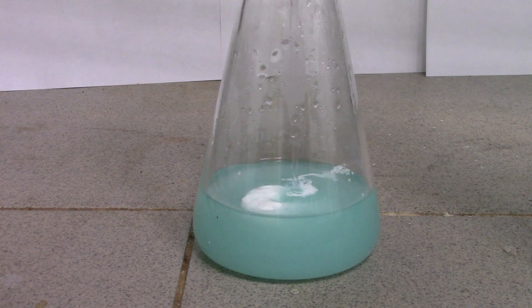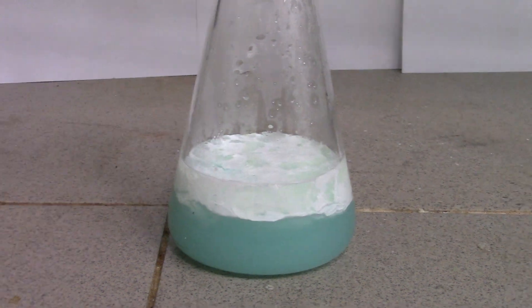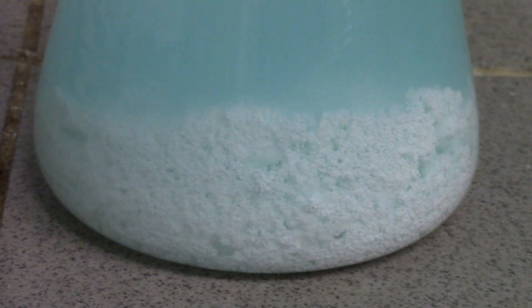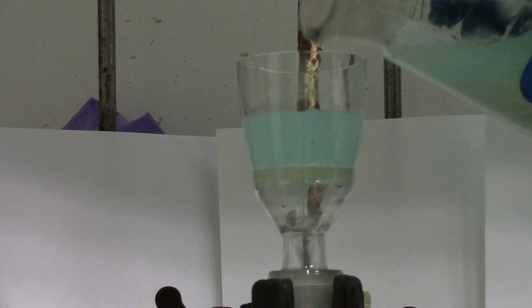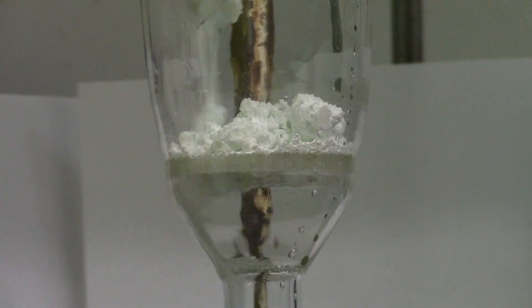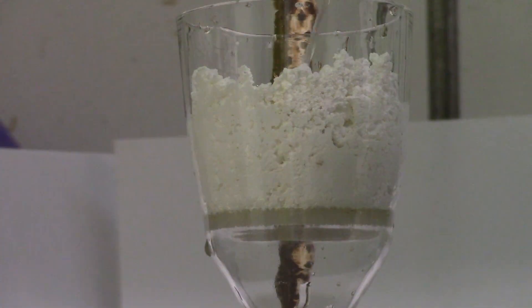A curd-like white precipitate is coming out. Then we need to filter it off, wash 3 times with distilled water and 3 times with isopropanol.